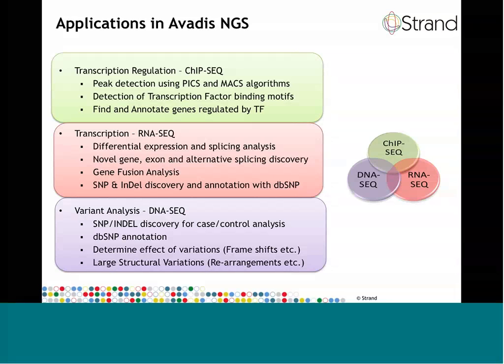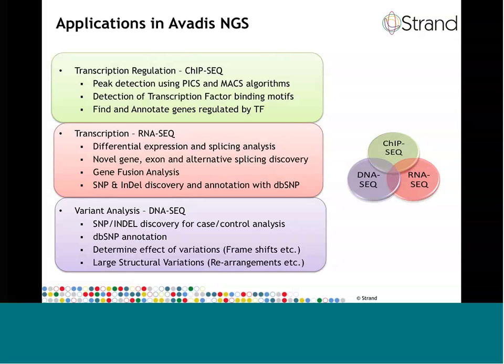For transcription factors, this can be followed up by looking for potential binding motifs in and around those peaks using motif detection algorithms such as GADEM. In addition, the genes that are close to the detected peaks are good candidates for being regulated by those transcription factors and can also be detected. The gene ontology and pathway analysis tools can then be applied to learn more about these sets of regulated genes and their respective targets.